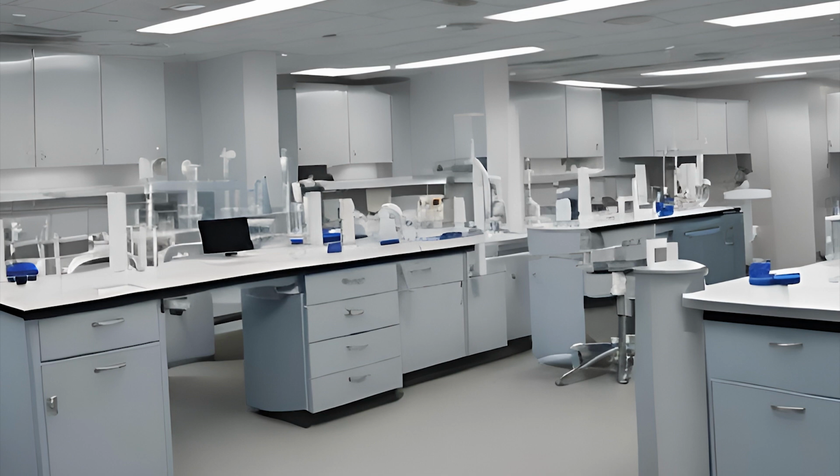Stat or medical emergency specimens will take priority over all other specimens. They're going to be transported, processed, and tested immediately. That means you will stop what you are doing and handle the stat or emergency work first.